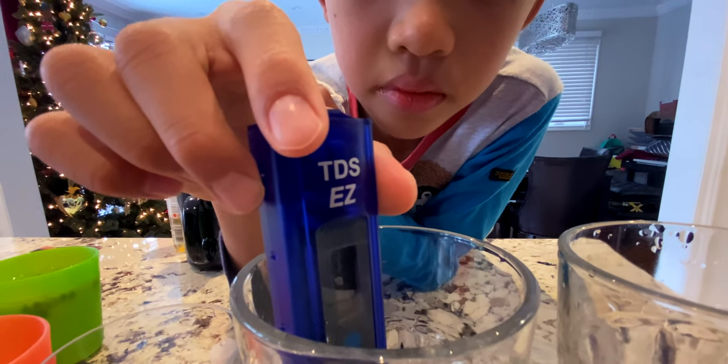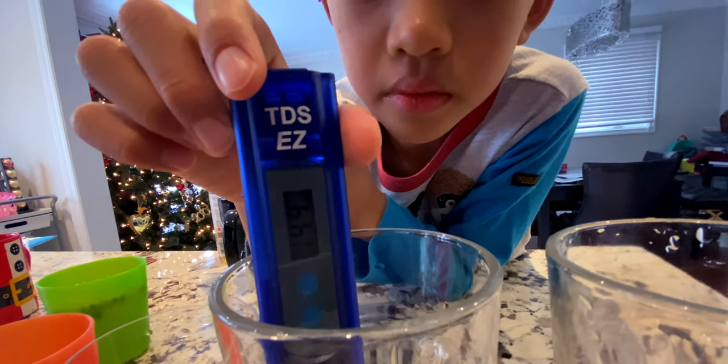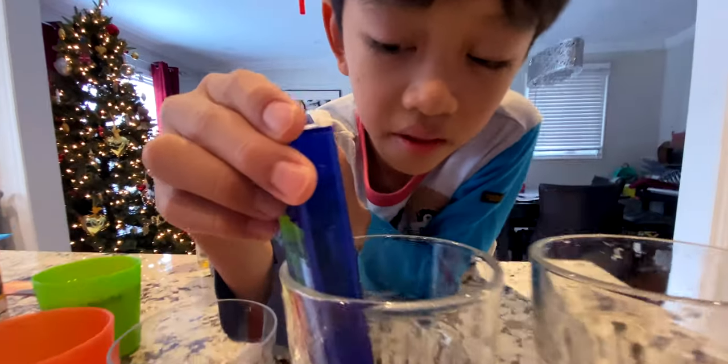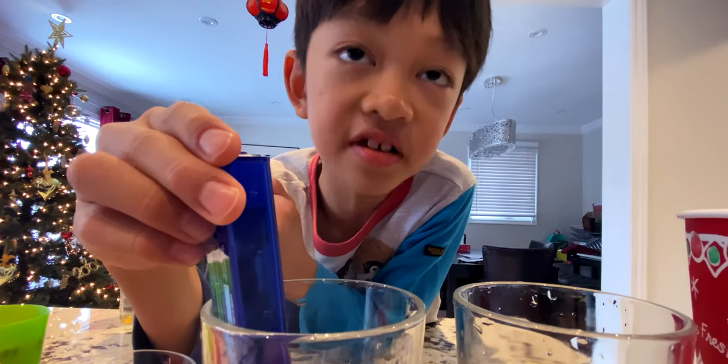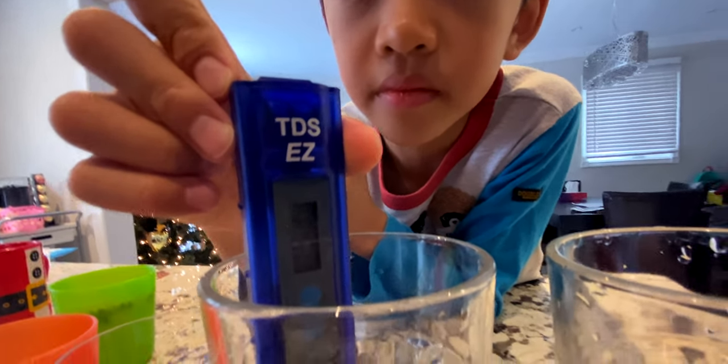What is it reading? 144. Let's do it again — 153. Okay, 153.